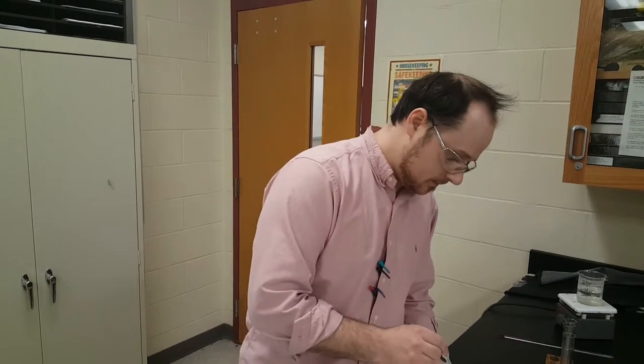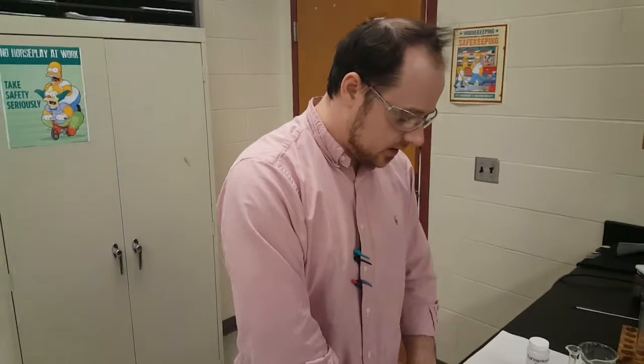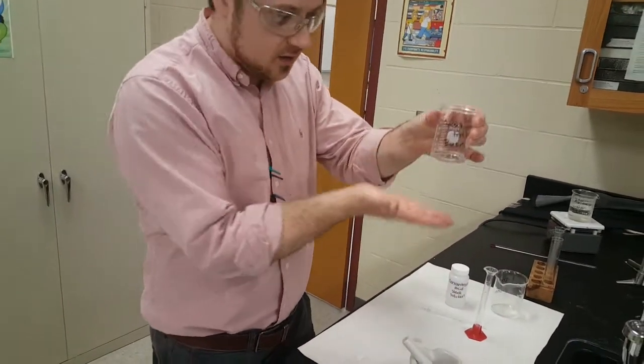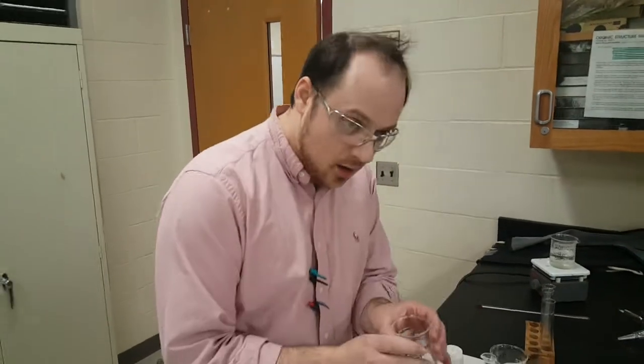And it's key here that we have 20 mils of solvent total each time. So now I'm not changing more than one parameter at a time. We're controlling the volume of the liquid that we're reacting the tablet with. So let's pretend we have our diluted acid in here, 5 mils of water, 15 mils of acid, tablet, boom. 1 Mississippi, 2 Mississippi, until it completes the reaction. Excellent. Record the value in your data chart. There it is. High, medium, low.